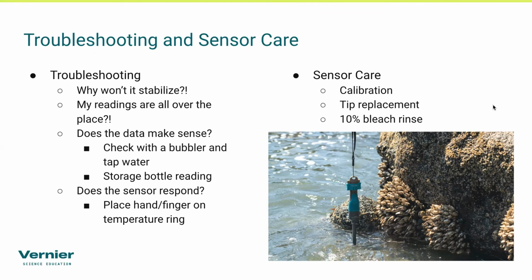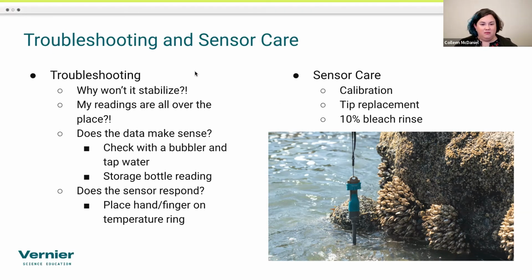Hey, Colleen, there is a question in chat about storage, and is tap water okay for that? I think tap water would be fine in there. I've done it in a pinch. Distilled water in theory is the best because tap water does have a little bit of salts in it. So as it evaporates, it's going to leave the salts behind. That's usually why we recommend distilled over tap. But in a pinch, tap is totally fine.